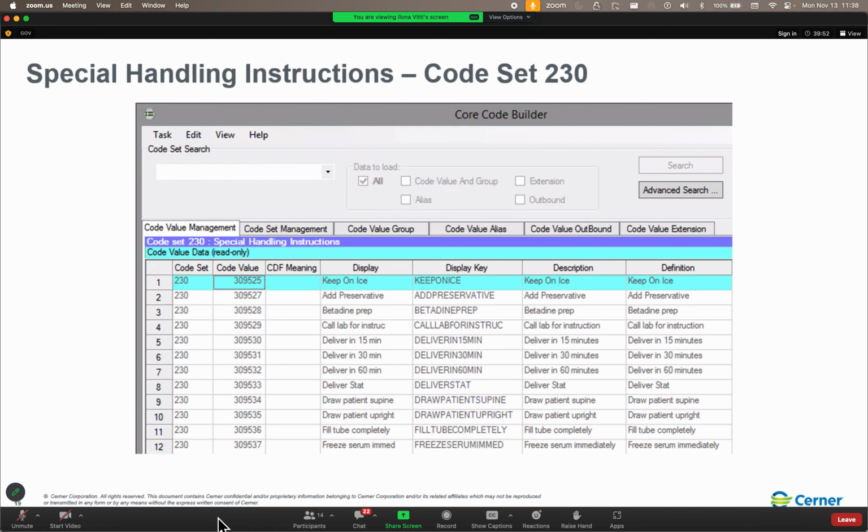Again, folks, that is because we have a limited amount of real estate on the specimen label. So I need to have less than 15 characters on it, which means I've got this many to work with.